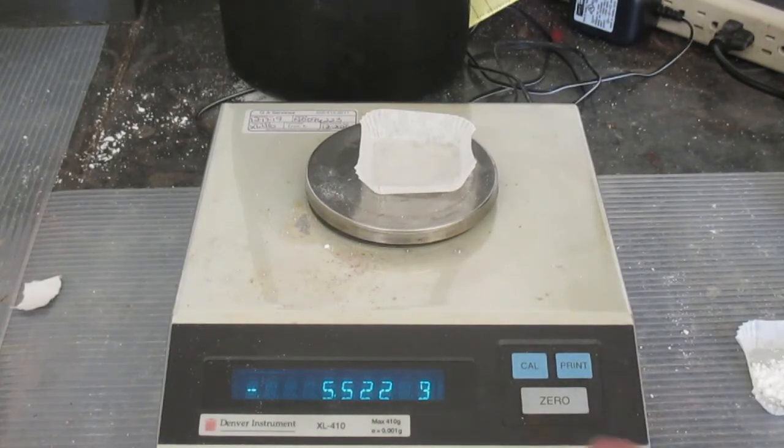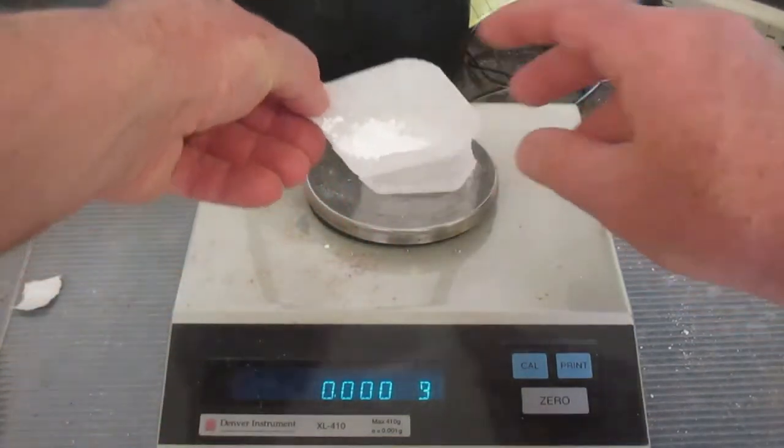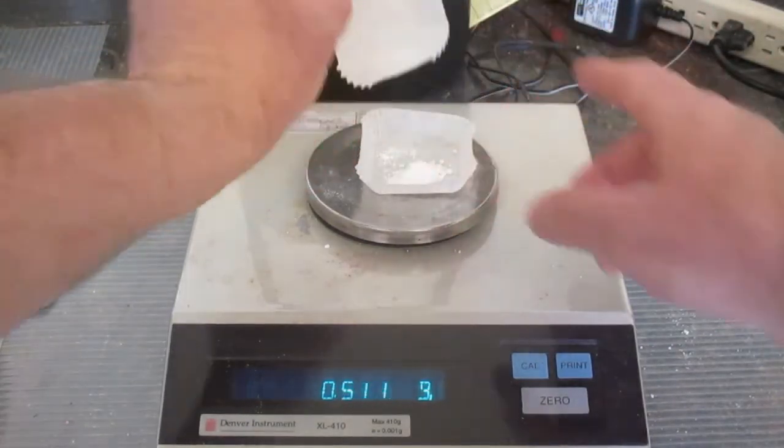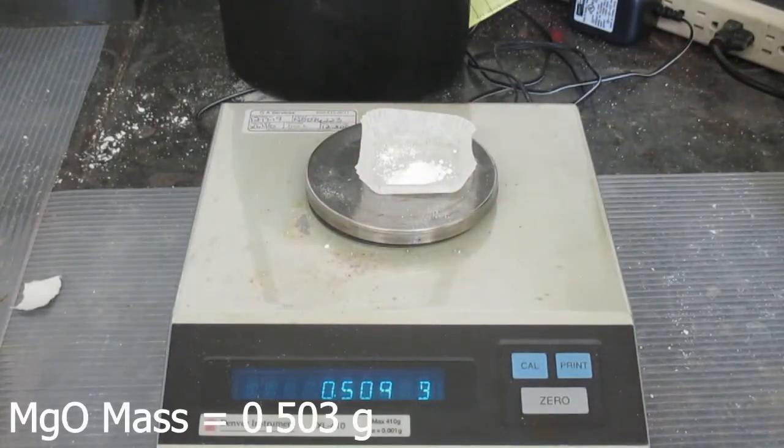Once again, now, instead of using magnesium, we're going to be using magnesium oxide, and I have to record the mass of the magnesium oxide. So I have my weigh boat here. I'm going to zero out my weigh boat, and I'm going to add in my magnesium oxide. That mass should be somewhere around 0.5 grams. And so what we have here is 0.503 grams. And we're going to then add that to an HCl solution.